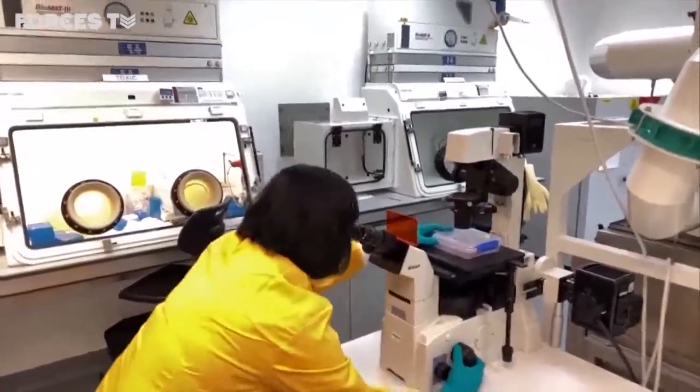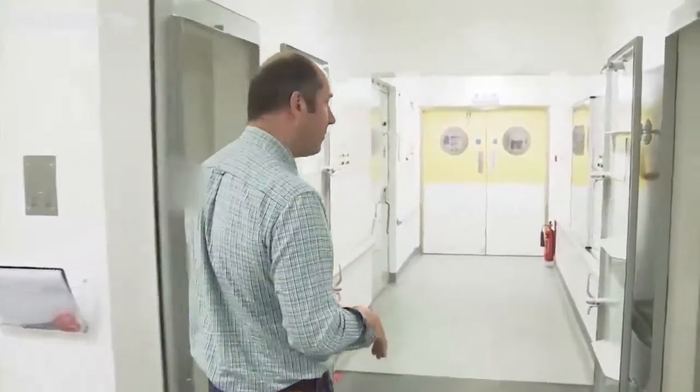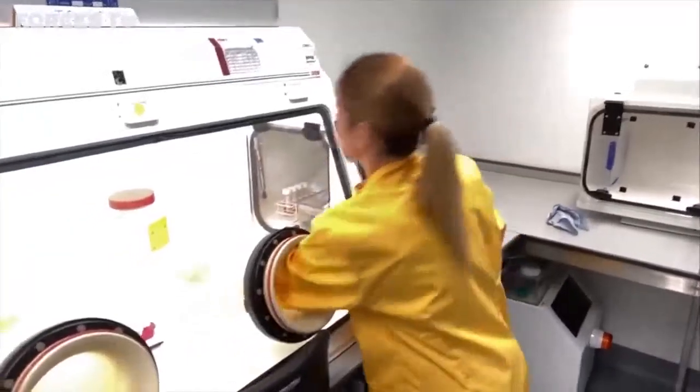The labs are held under negative air pressure to prevent anything leaving them that shouldn't. 80 microbiologists work in this arm of DSTL alone. And you can see quite a big capability here, so probably one of the biggest capabilities in terms of handling dangerous pathogens in the United Kingdom, and that makes us reasonably unique. And this facility here specifically is the one where we are currently doing the experiments with COVID-19. Scientists are necessarily cautious with the virus. COVID-19 cultures are handled in sealed glove boxes.